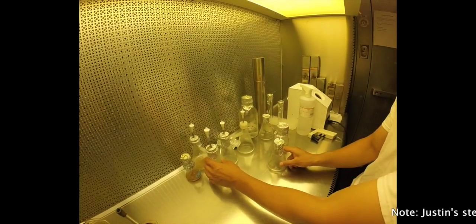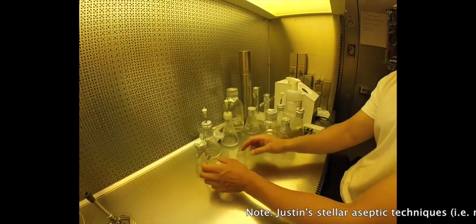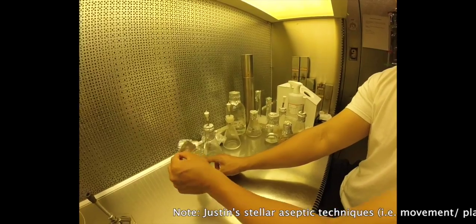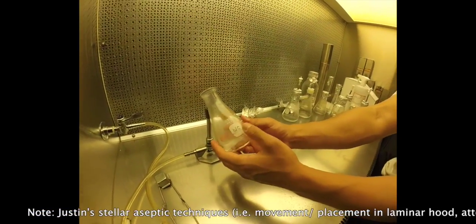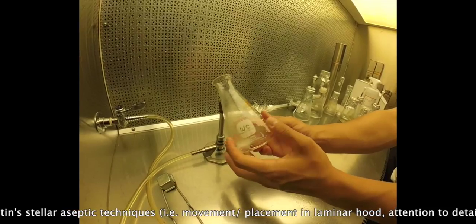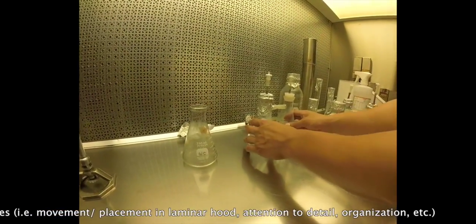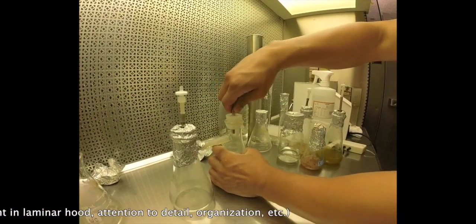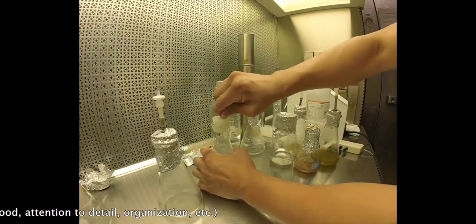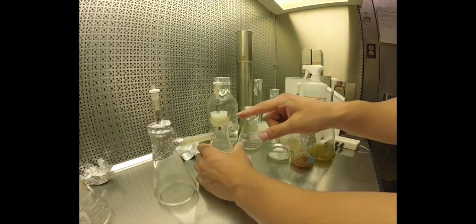And so put that right there, and then I have my stopper holder next to me. Clean it off so the condensation is all evaporated off. And then we can take the stopper off. Just want to tilt it back and forth, and it should come off. And you don't want to hold the stopper too close near the top.